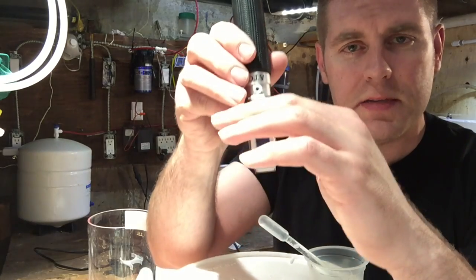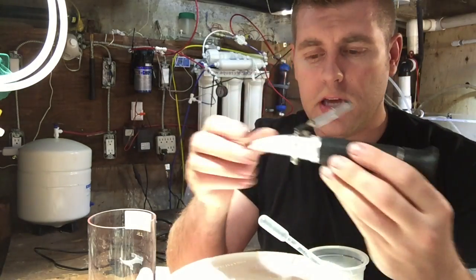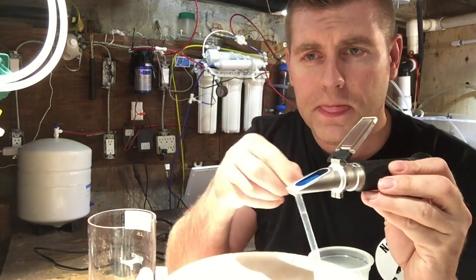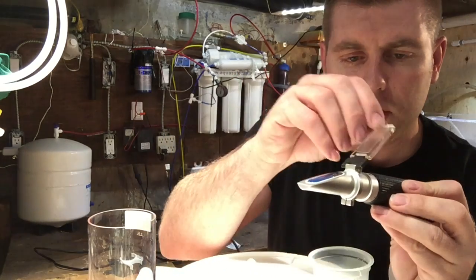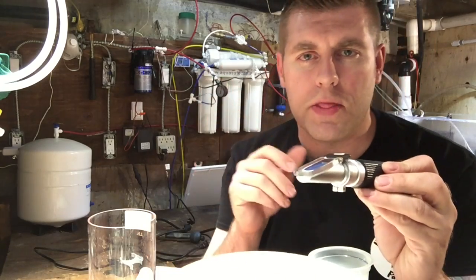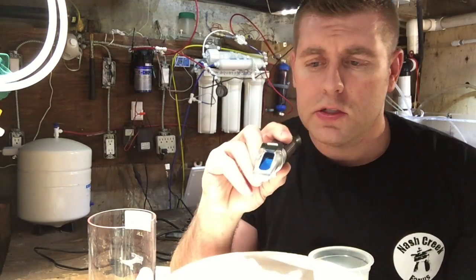What you want to do is get the blue and the white to meet exactly at zero. Open up the eyepiece, take your distilled water, and just put a few drops on it. Then close the flap and wait about 30 seconds.